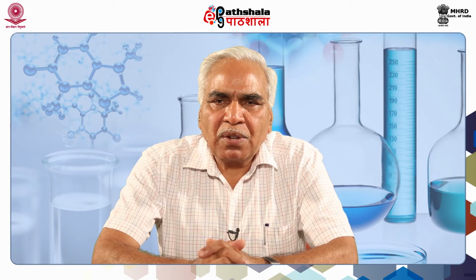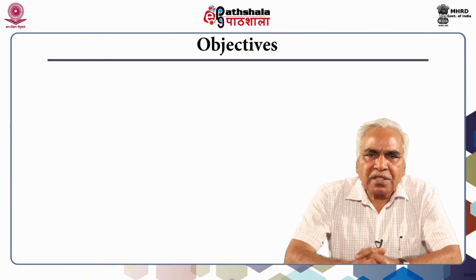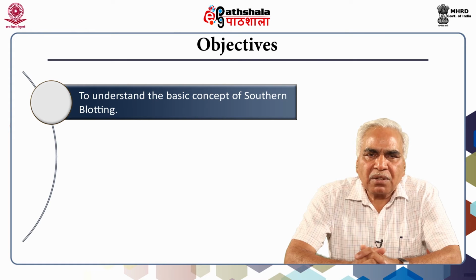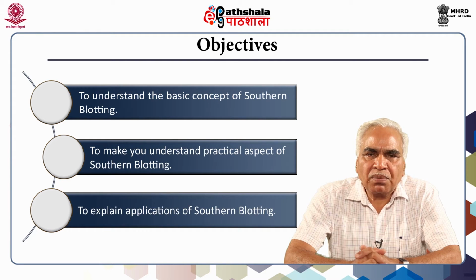The focus will be on how DNA can be transferred from agarose gel to membrane. The objective of the presentation is to understand the basic concept of Southern blotting, to make you understand the practical aspects of Southern blotting, and an added objective is to explain the applications of Southern blotting.